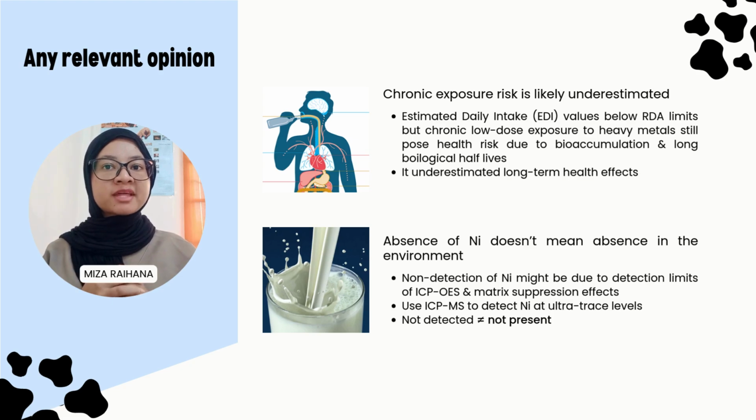The study also claimed that there was no nickel present in milk. Nickel was not detected due to detection limits of ICP-OES, so ICP-MS should be used instead to trace nickel. Not detected doesn't mean that it's not present.